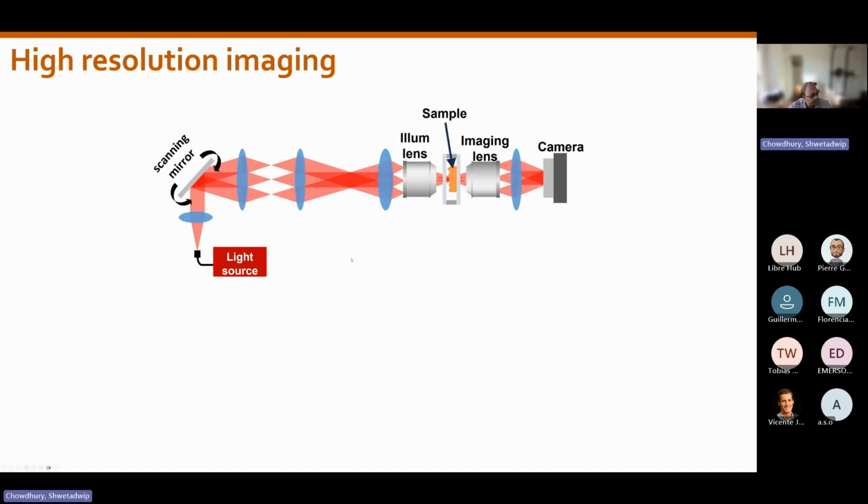To give some perspective, for a lot of the reconstructions that I showed earlier, like with the zebrafish or the organoid, we had to collect around 500 measurements. So the total time to collect all these measurements can be tens of seconds. If your sample is moving at speeds faster than that, then you're in trouble.